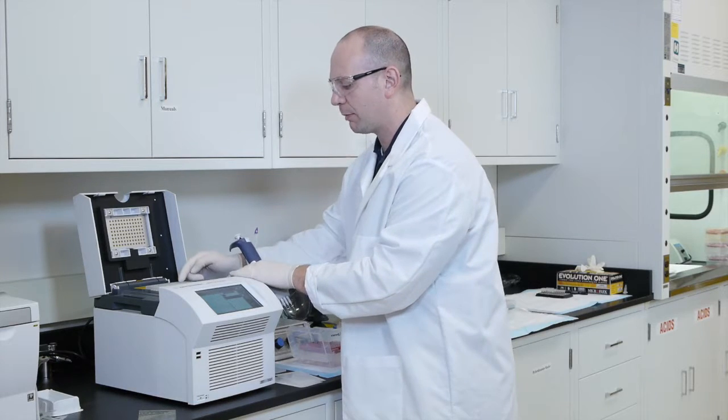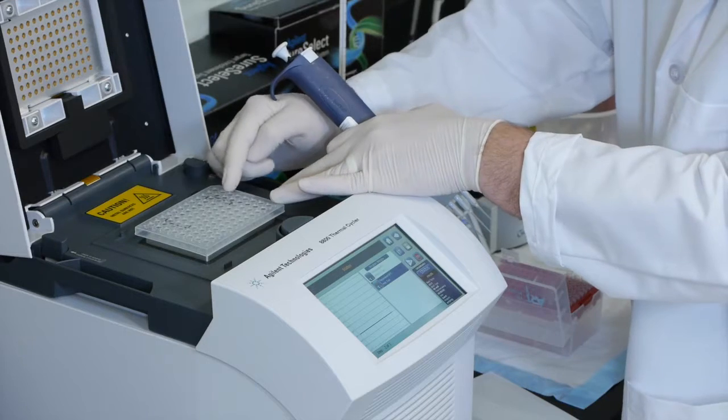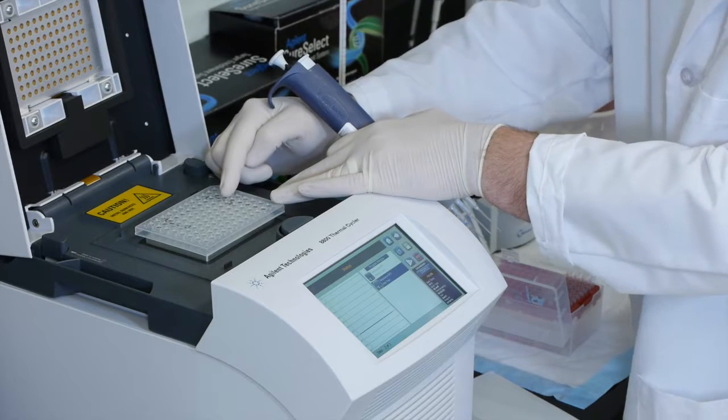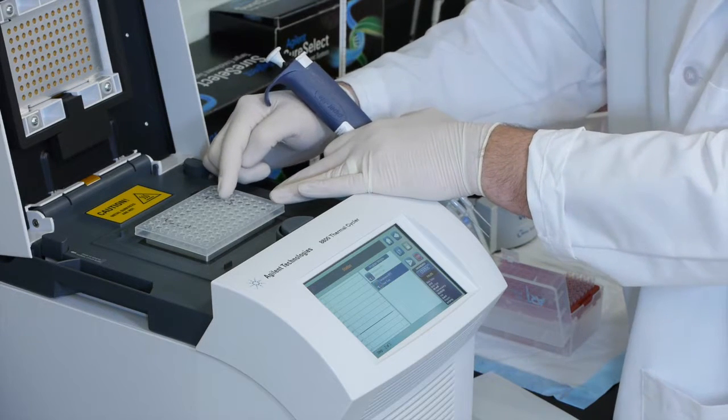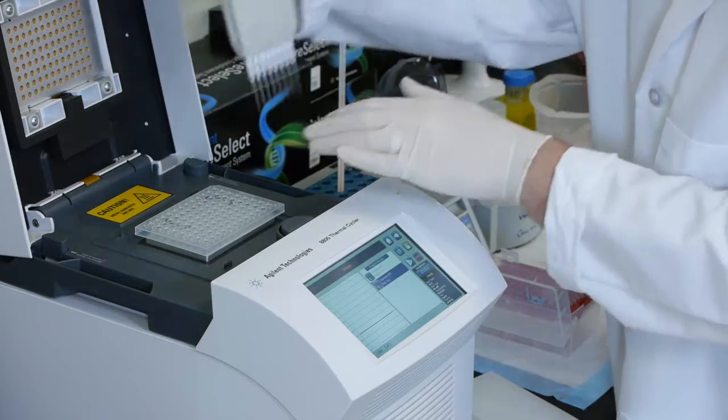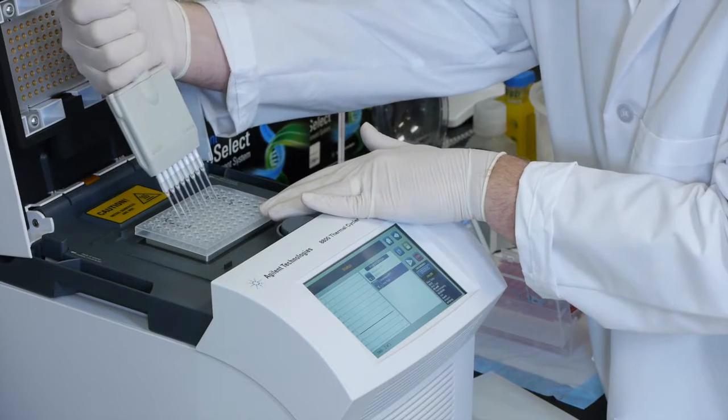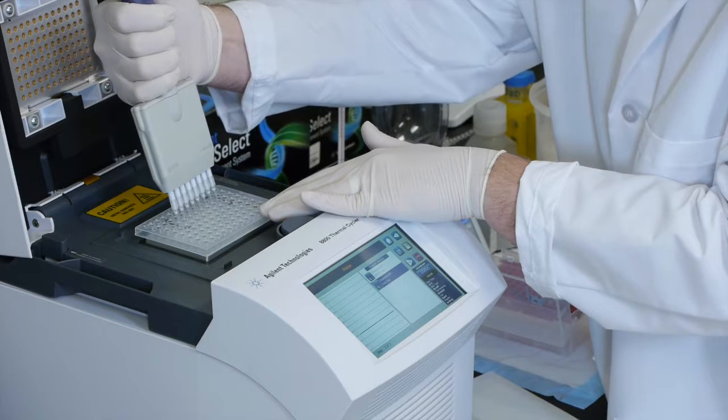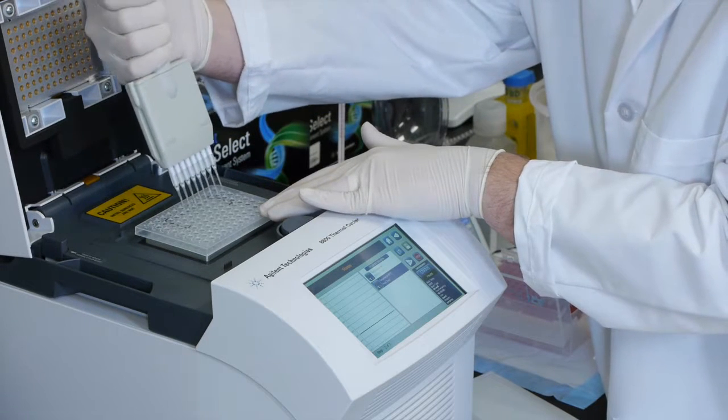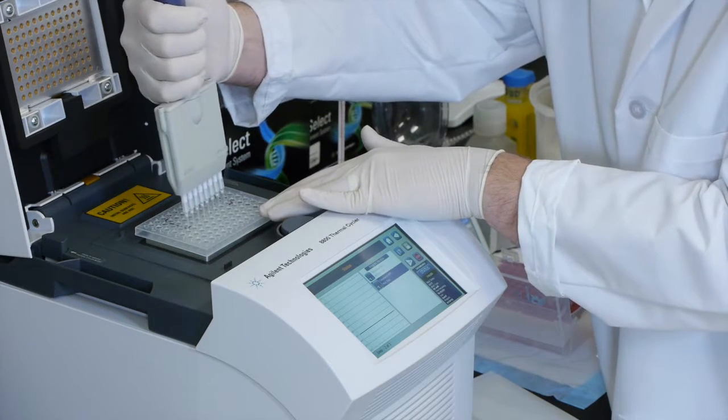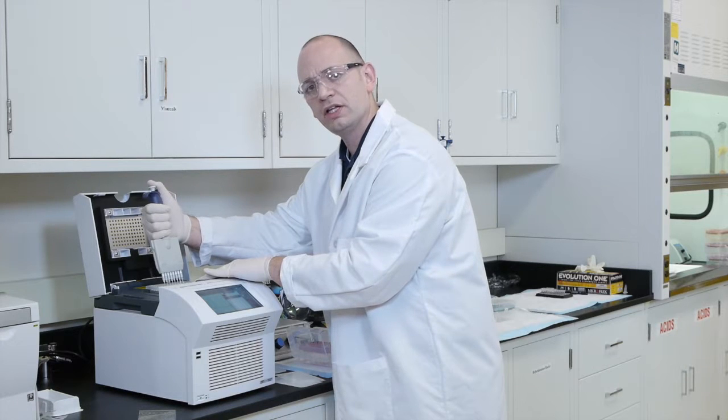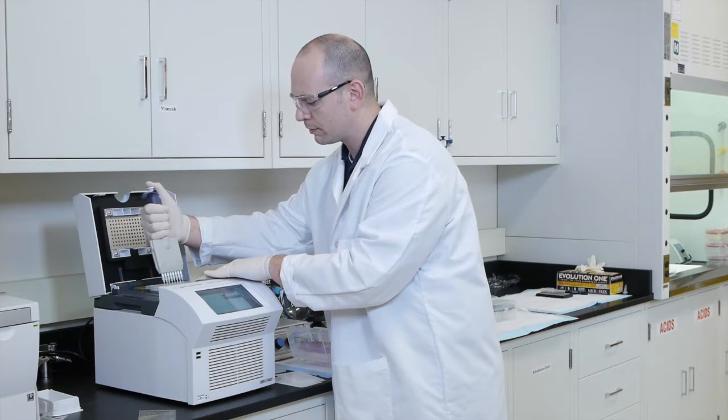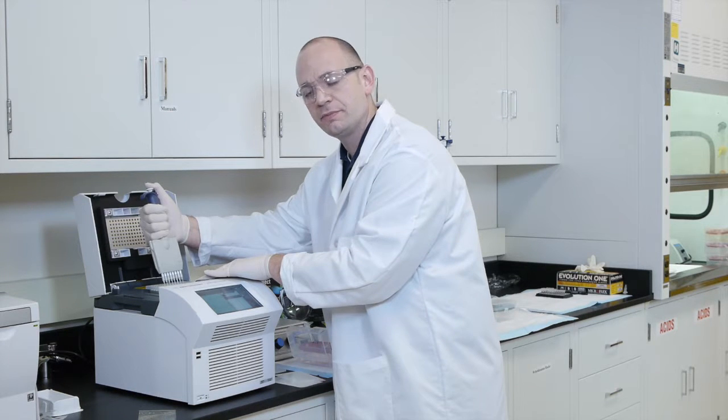So what we've done is we've transferred hybridization buffer from this row to this row. Now we're going to transfer the contents of the middle row to the bottom row. You'll then mix this thoroughly at least eight to ten times. And then upon completion of this mixing, you're going to carefully reseal the plate using a double PCR seal.